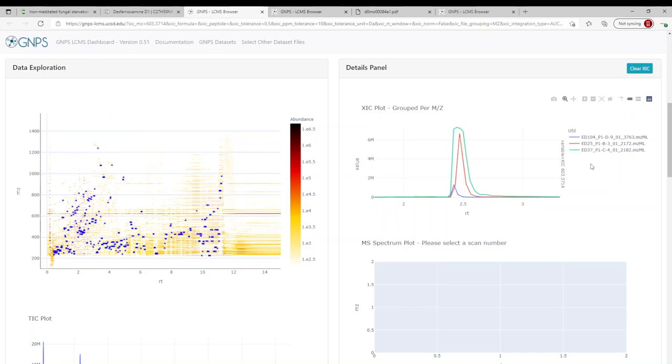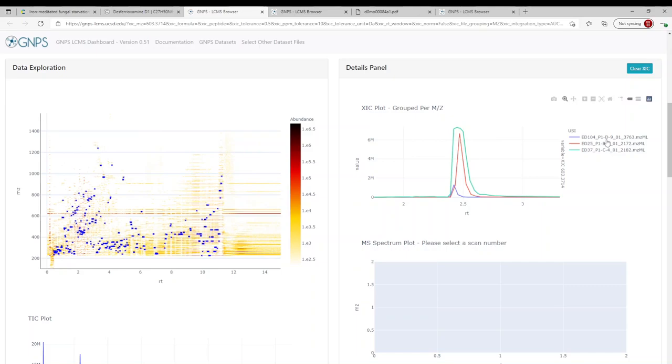But this is exactly what we want to see. We can quickly dereplicate this compound and say yes, it's here, this is where it is, and it's in all three samples. So this is super useful for us as natural products chemists to start deducing. This really shows one of the most basic workflows for all of us, and it can be applied to any metabolite from a dataset or from literature.